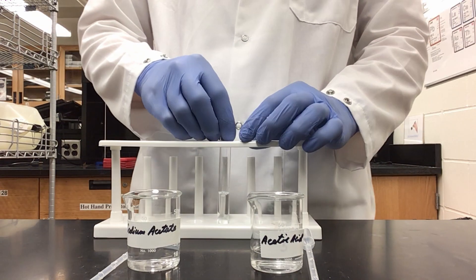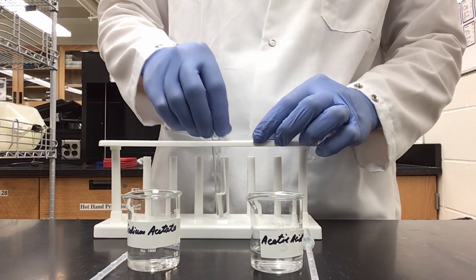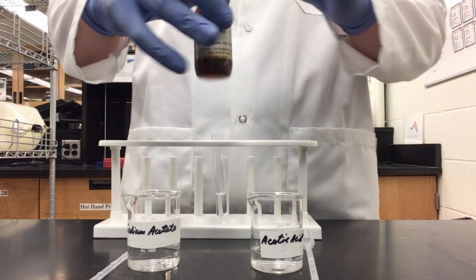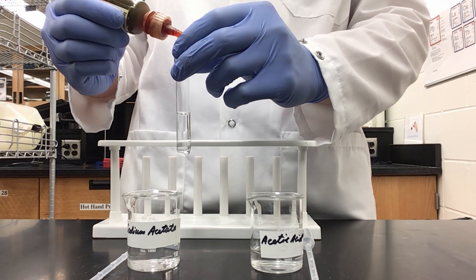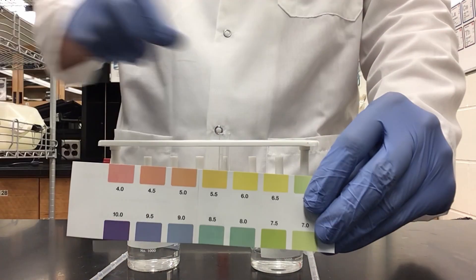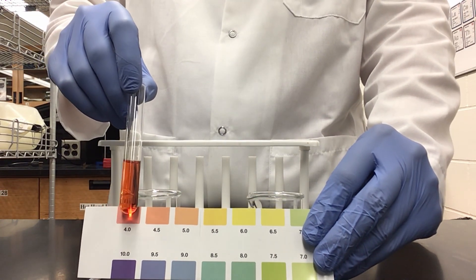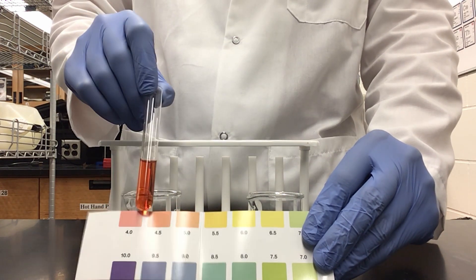I've added two milliliters of each into my test tube, mixed it together, and now I'm going to add several drops of universal indicator solution to check its pH. Here is my indicator chart, and if I take my test tube, we can see that I am sitting near the 4 to 4.5 range, so we are in the acidic range.